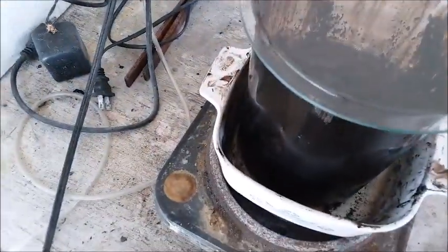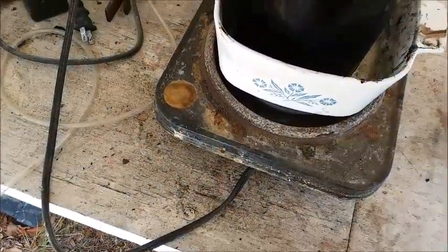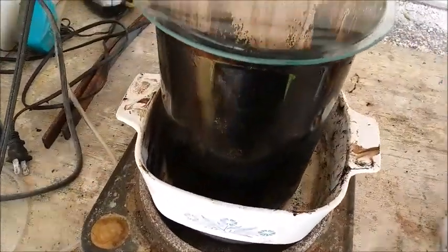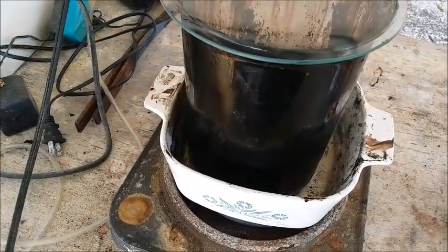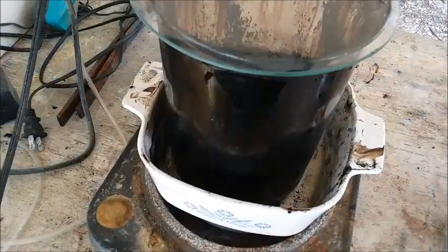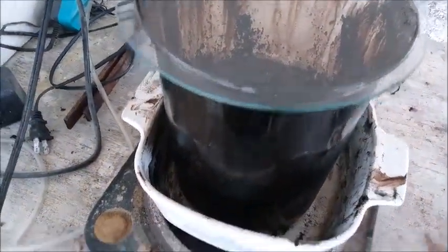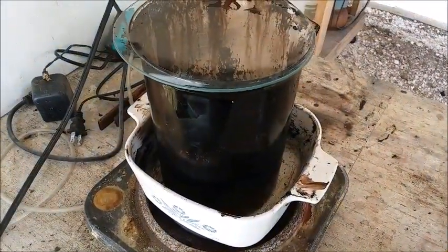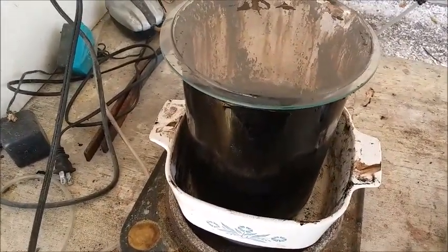So I'm just gonna let this cook for a while longer just to make sure all of that epoxy is digested in there. Then I'm gonna let it cool down, probably overnight, and deal with it tomorrow morning when it's cool. Because sulfuric acid's bad enough to deal with. Hot sulfuric acid, well, that is scary stuff. That'll practically burn you to the bone if you splash some of it on you. So I'm gonna let this cook a little while longer just to make sure the reaction is done, turn it off, let it cool down, and then we'll see what we got tomorrow.